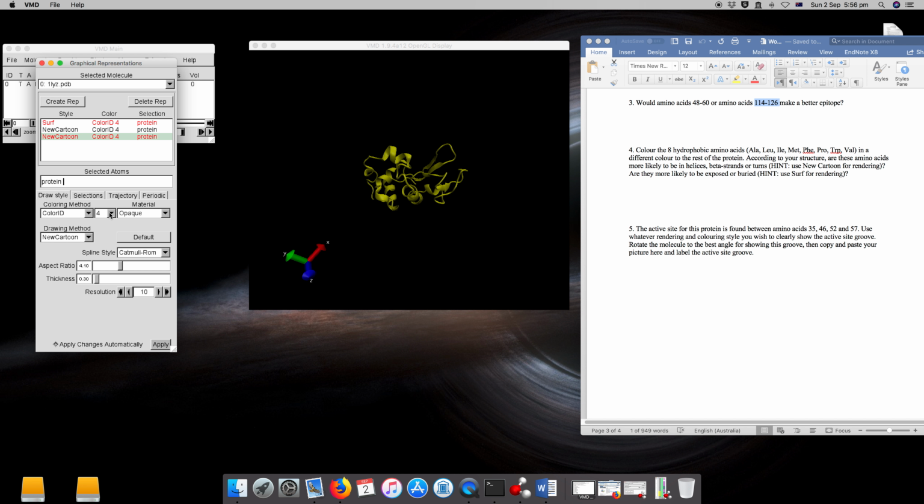If you can't find it in these keywords, then you can go to these single words as well. So we just look for a command, hydrophobic or hydrophilic.